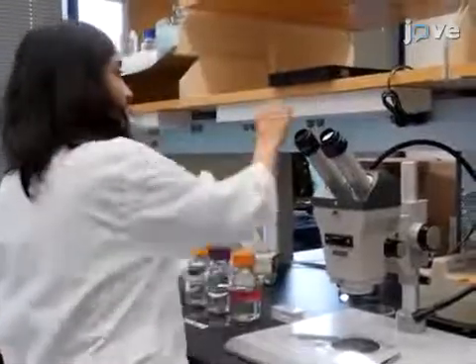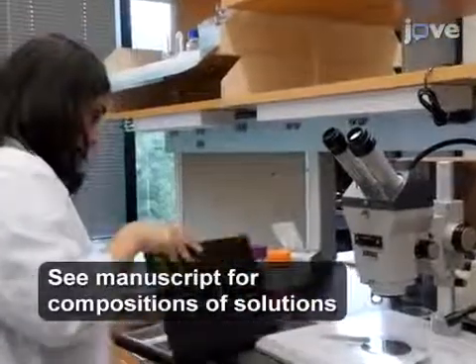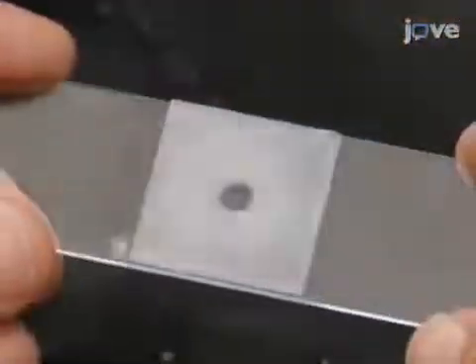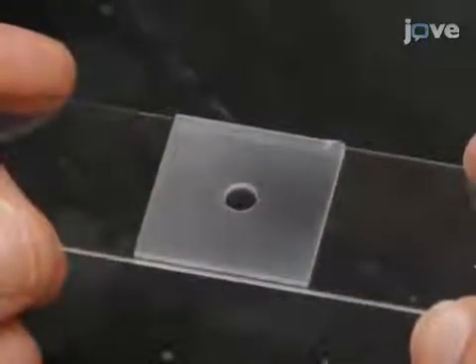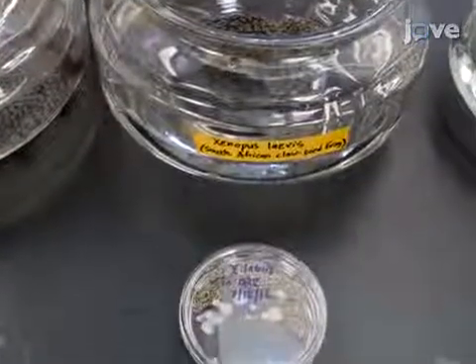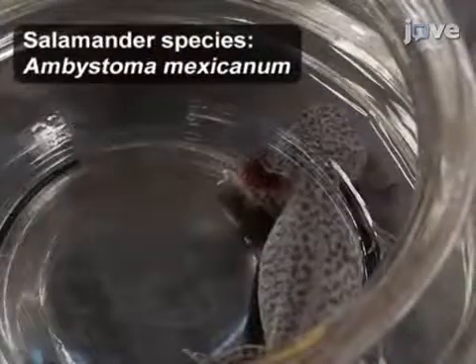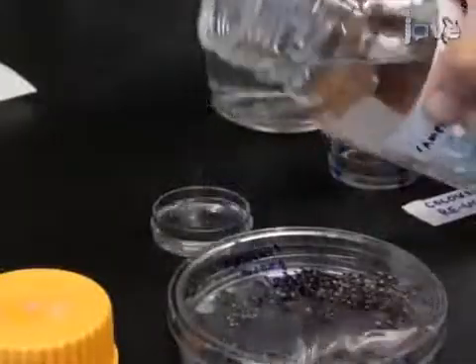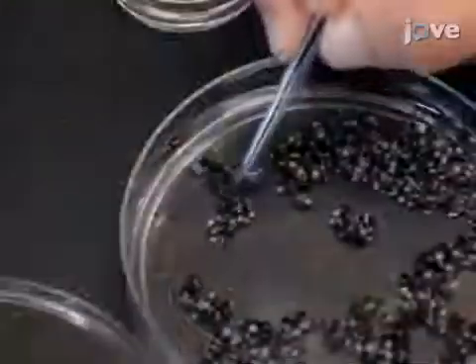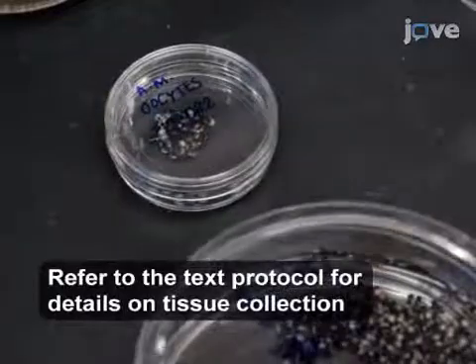After preparing all of the required solutions, assemble well slides composed of subbed glass slides to which plastic wells have been attached with paraffin, as discussed in the text protocol. Then gather ovarian tissue previously collected from an adult female frog or salamander and fill a small petri dish with oocyte culture medium. Proceed to place a portion of the isolated tissue, one containing approximately 10 to 20 oocytes, into this plate.